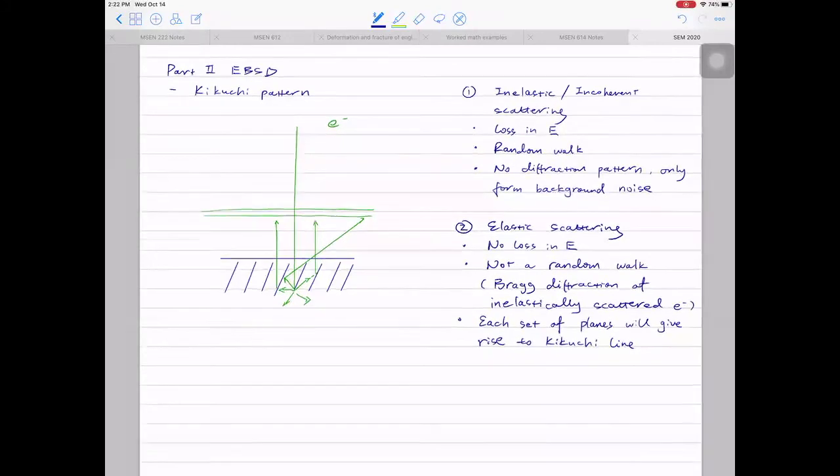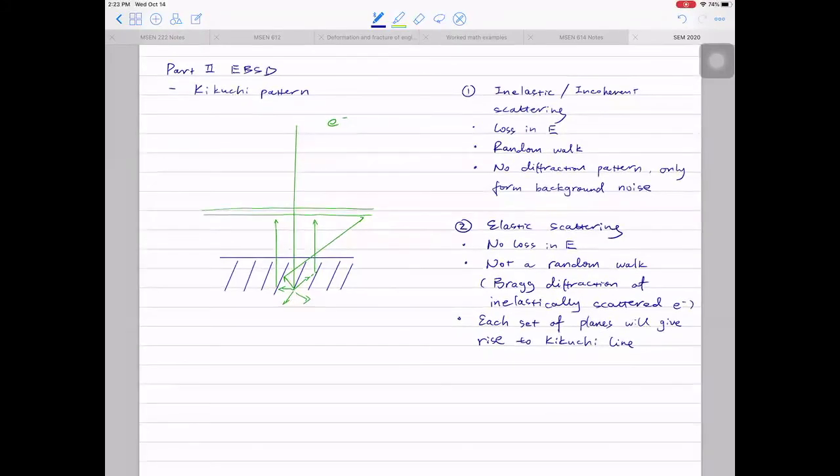If you do not understand this, it is okay, because when we show the PowerPoint slides, you will see some examples. The main takeaway message here is to make sure you know that for Kikuchi patterns to form, you have to undergo the inelastic scattering first, then elastic scattering.